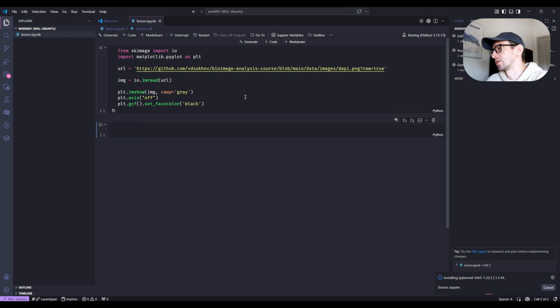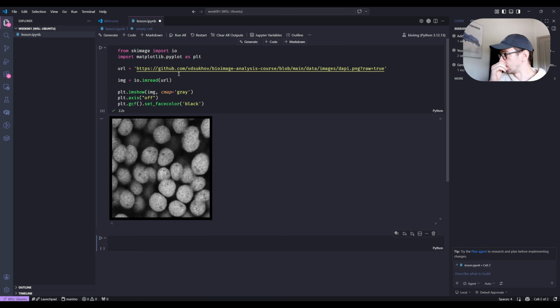While it's installing, I just want to go over the code that we created, because the idea is that we want to understand what is happening. Right now, in the era of LLMs, they can spill out a lot of code for you, and for us the best way to learn something is to understand what is happening, not just to blindly execute code and be happy with that. We want to understand what is underneath.